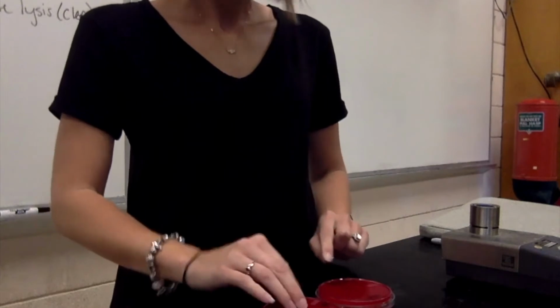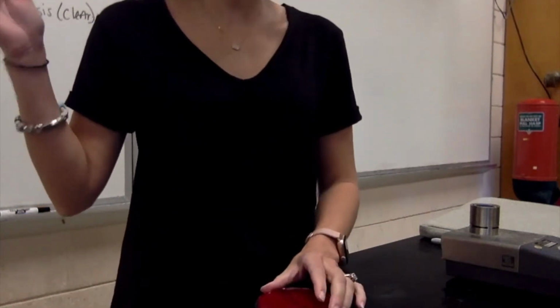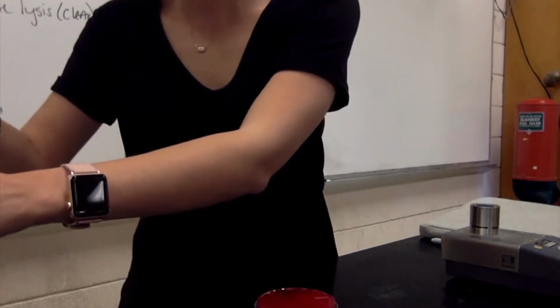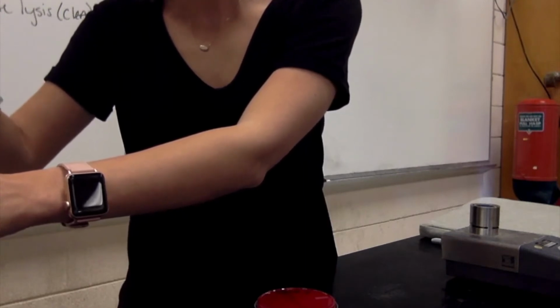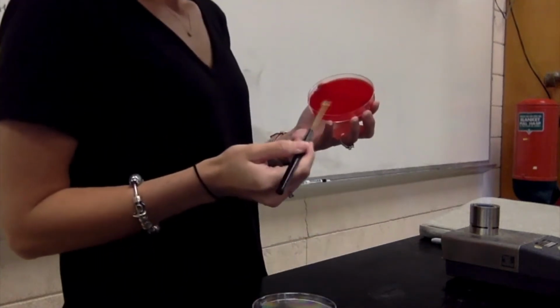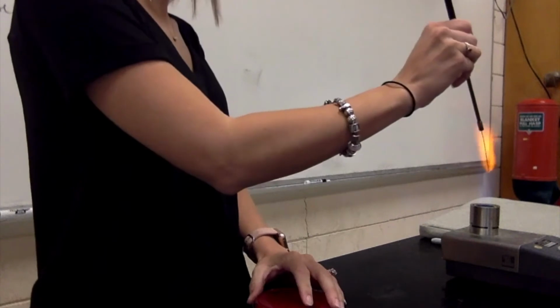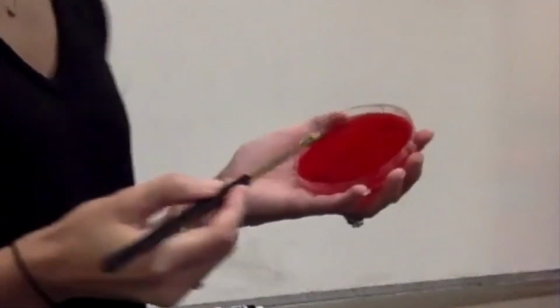Okay, so I'm going to do the Staph first. Go ahead and get that one out of the way. This is, again, the normal streak plate. Okay.